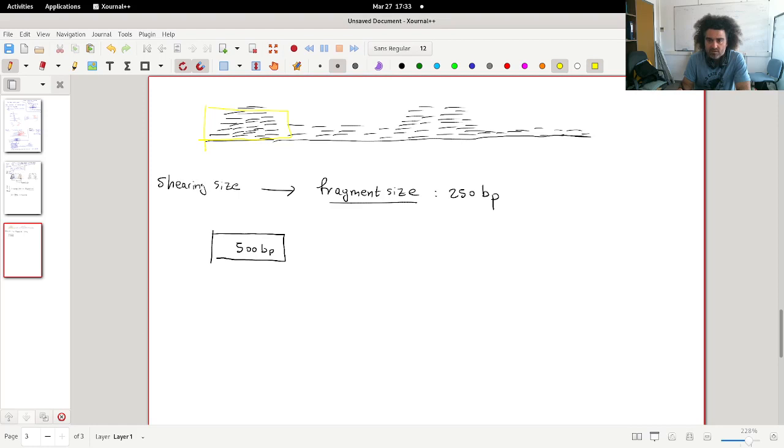So let's say that in this one we find 35 reads. And then we move this window 1 position to the right. I'll use another color. Yellow is too light. And we measure again the reads. Let's say that this orange window contains 41 reads, and so on and so forth.